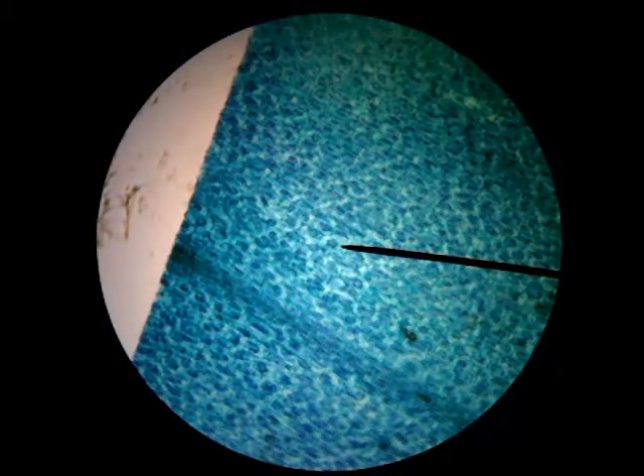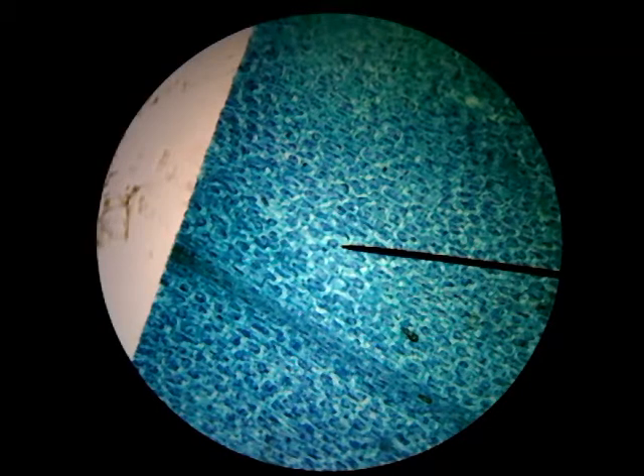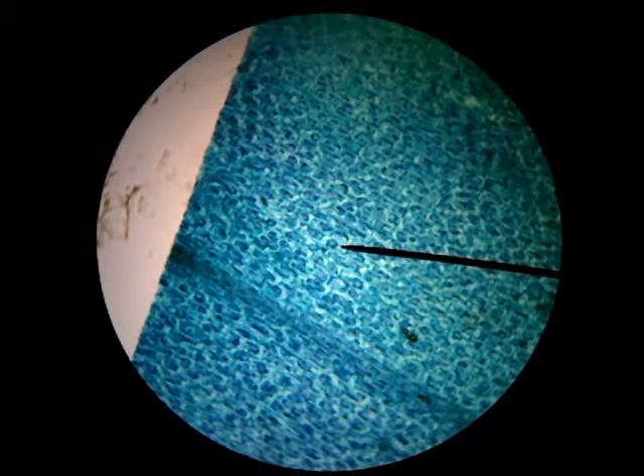We're starting to see some cells. I'll use my fine focus to get as close as I can — it's a little blurry because I'm looking through the screen. You should start to see some little cell walls. All of these different ridges are cell walls, and we're seeing some chloroplasts — these dark things inside the cells.